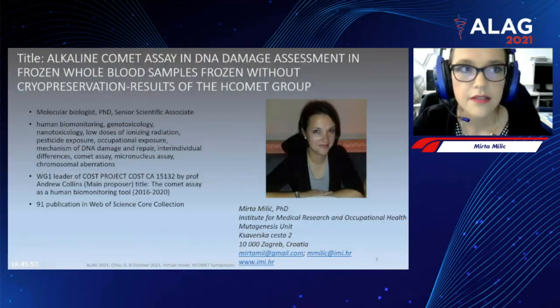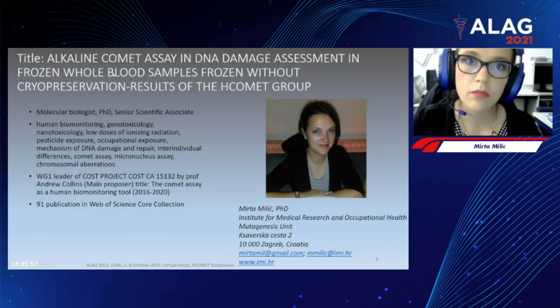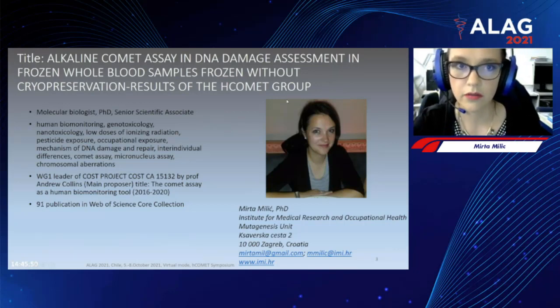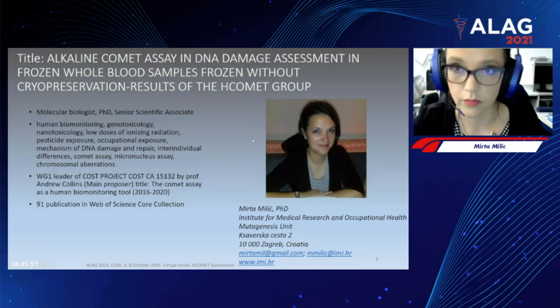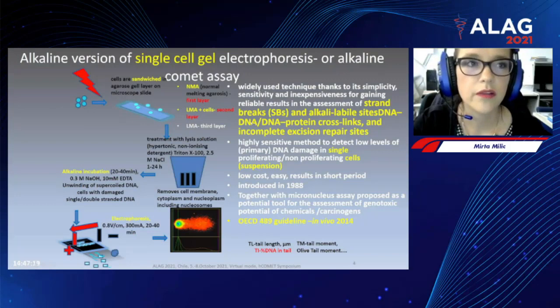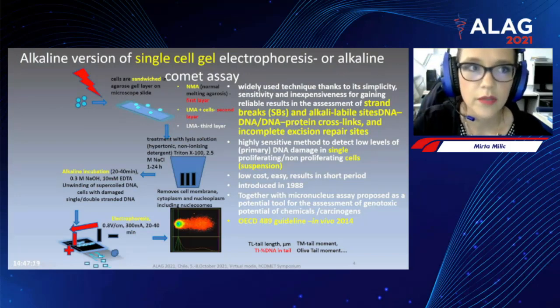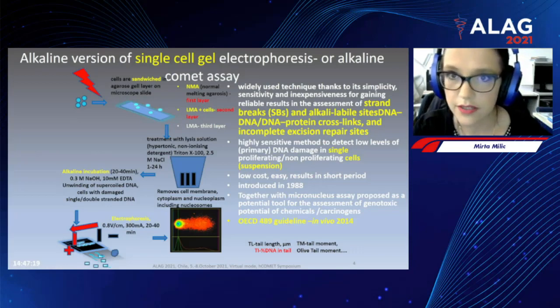So the title of my presentation is Alkaline Comet Assay and DNA Damage Assessment in Frozen Whole Blood Samples, frozen without cryopreservation. And I will present you the results of the hCOMET group. But before I start, I need to explain what the alkaline Comet assay actually is, or this alkaline version of the single cell gel electrophoresis.